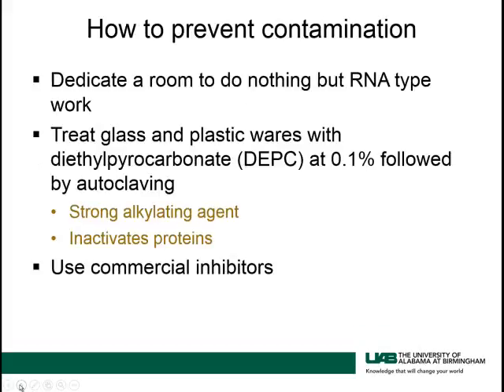Well, how do we prevent contamination? Number one, you need to dedicate a room that involves no other work other than RNA work. In other words, if you have a small interior room, you can just clean it up, decontaminate it, put all the reagents that you're going to use for RNA there, clean all the gel boxes with DEPC or detergent, and then once everything is cleaned up, don't do anything else in there but RNA work. This is a dedicated room, and you'd be better off if you just leave it as that.